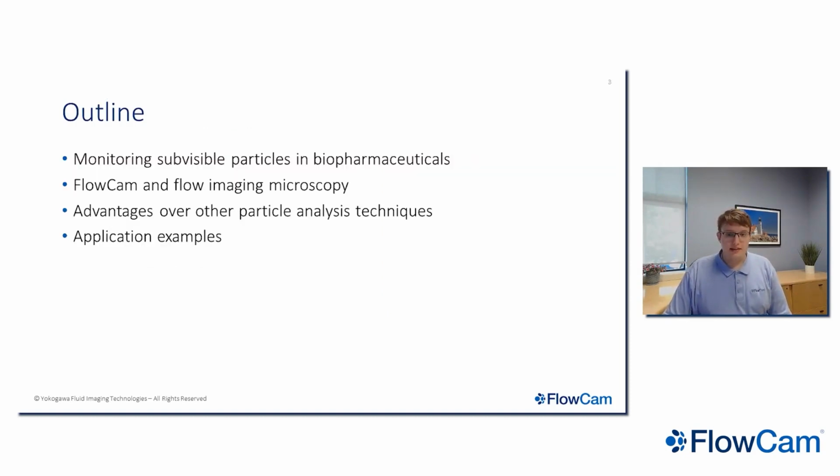So as that suggests, the way this will go is we will start with an introduction to particle monitoring in biopharmaceuticals before talking about FlowCam and flow imaging microscopy and a bit about how it works, then go through its advantages over other particle analysis methods, and then discuss some examples.